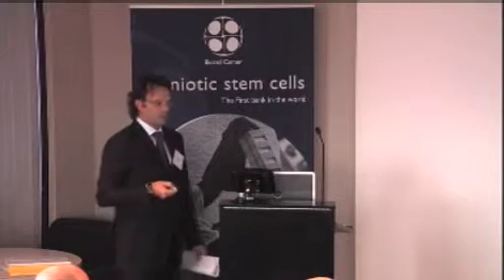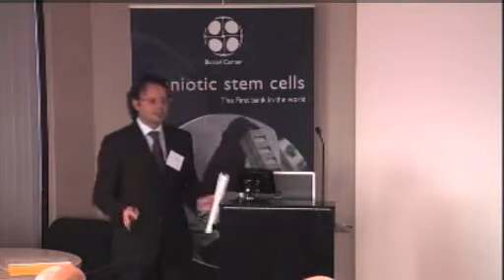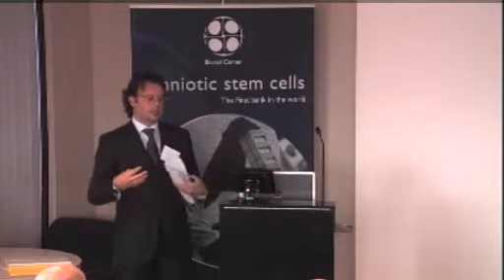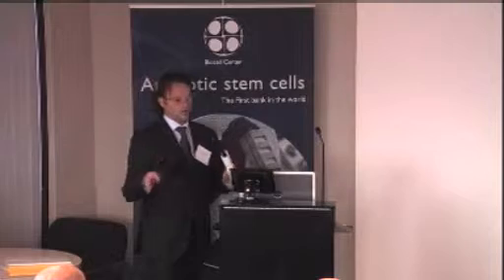An isolator, as Professor Simoni said, is a box. A stainless steel box with a window and gloves. The important thing about an isolator is that it's a separative enclosure. That means the operator can manipulate products inside the isolator only through gloves.